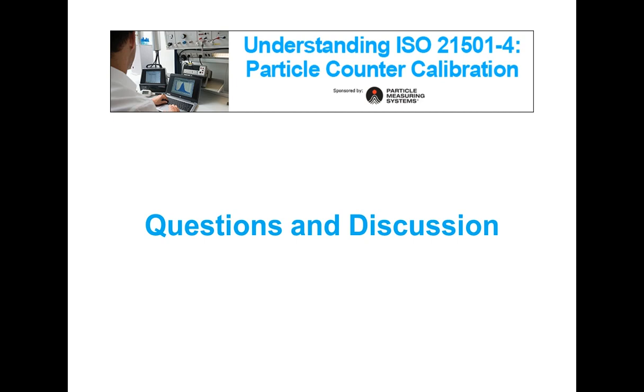It looks like they're asking about handheld particle counters, and are those compliant to the ISO? So the handheld particle counter as well needs to comply with the 21501-4 standard. Handheld particle counters are simply smaller and portable, but they do the same job as other particle counters and need to follow the same kind of standard.